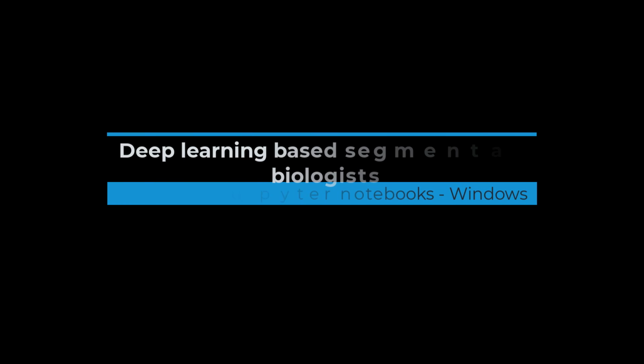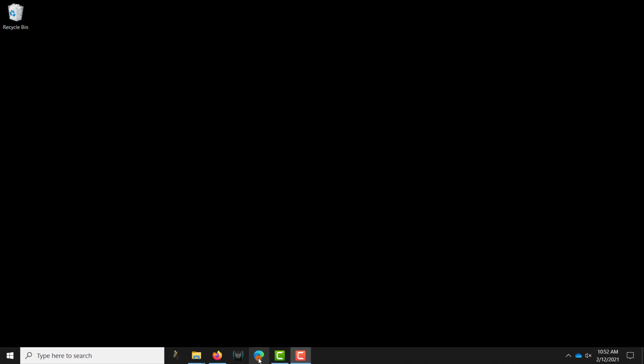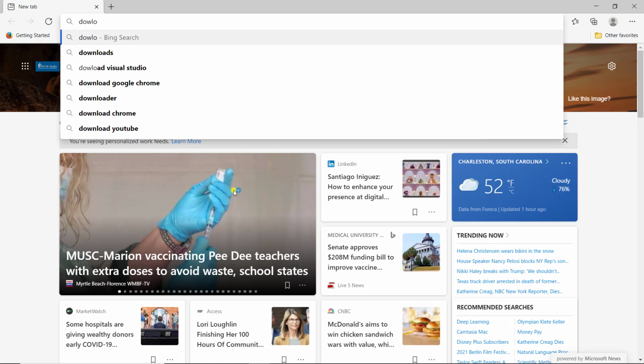In this video, I'm going to show you how to install R and all the required packages to run the data we generated with Annotator on Windows. So first of all, I'm going to download R. So I'm going to open Edge and then look for download R for Windows.